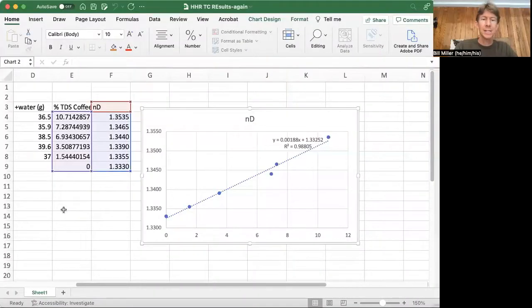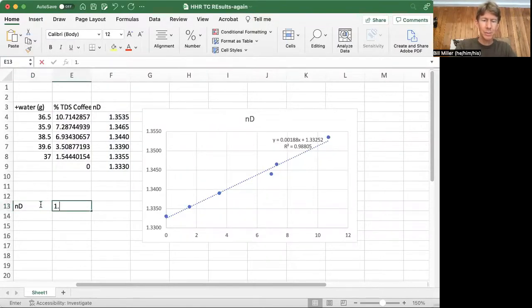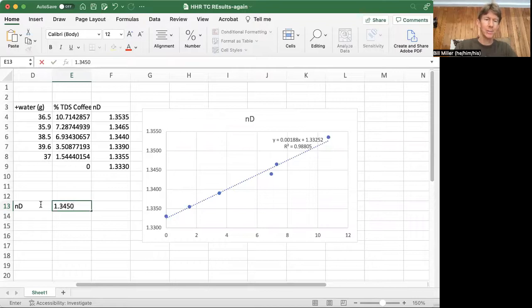So now I'm going to share my screen. This is the data, and I've just got that my refractive index, which we call n sub d, is 1.3450.